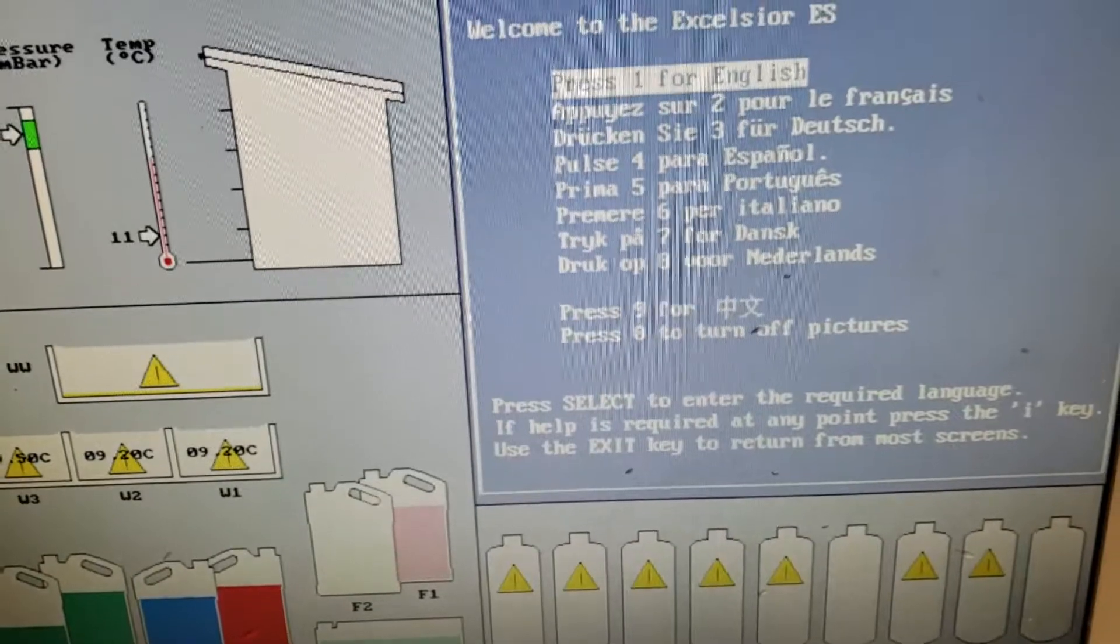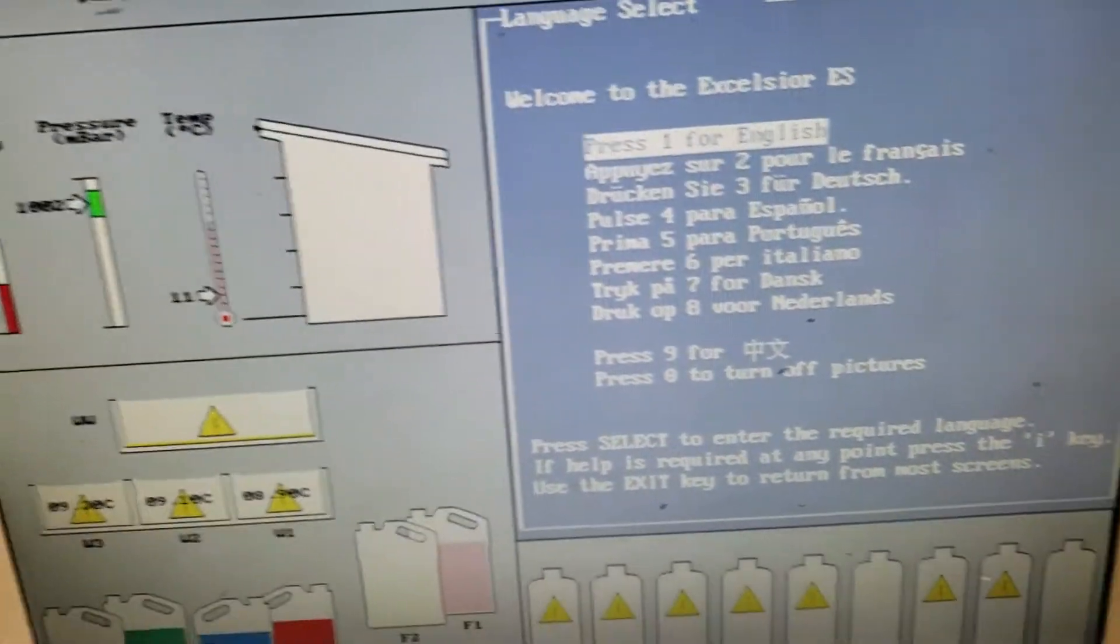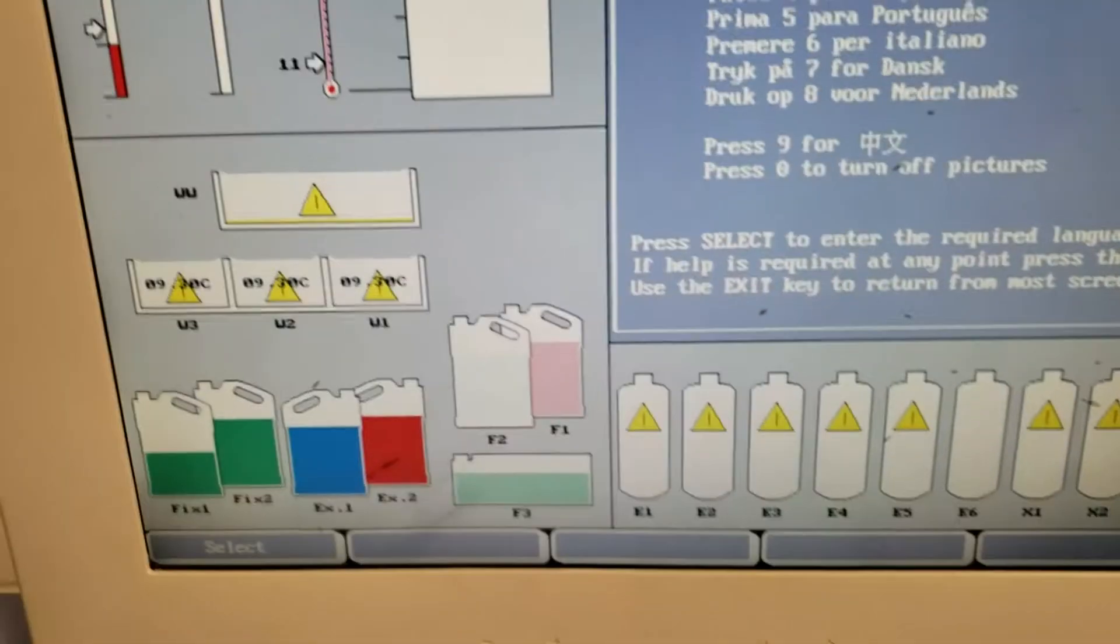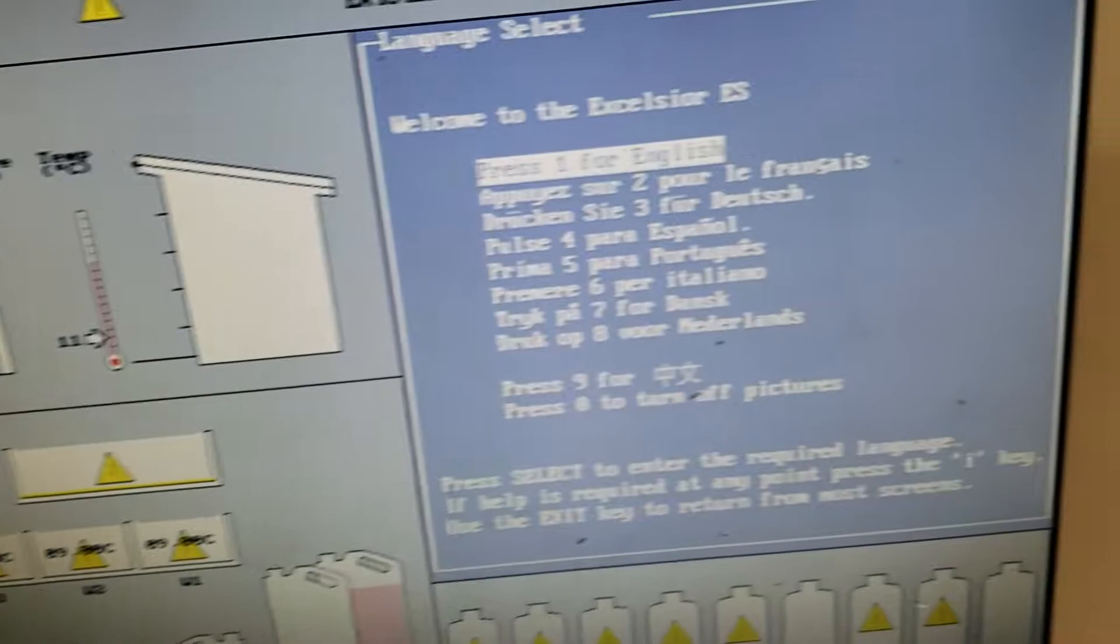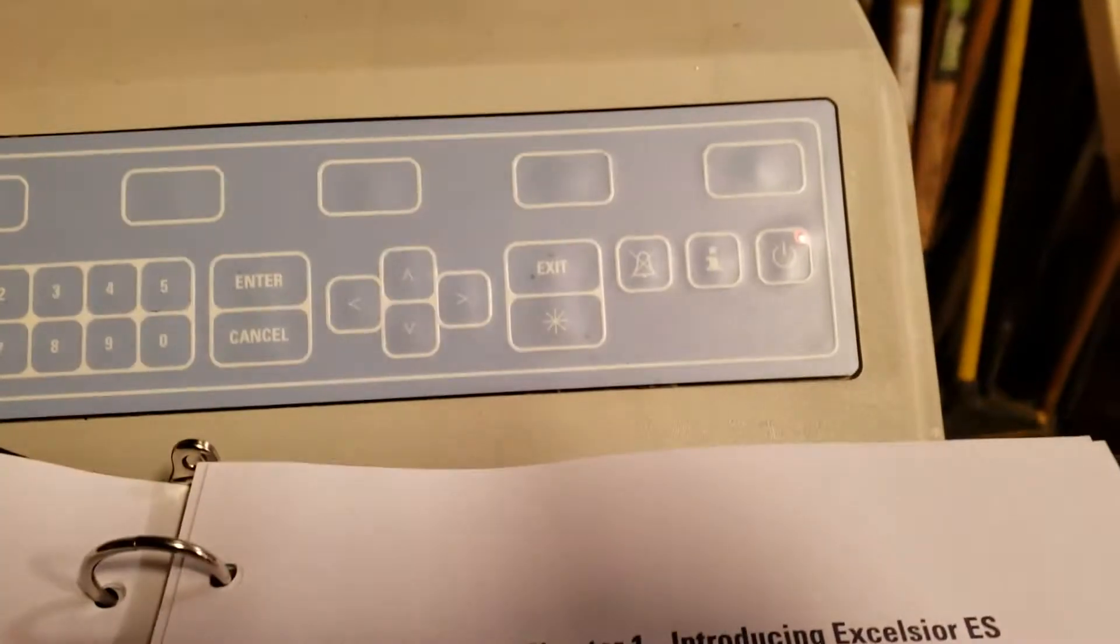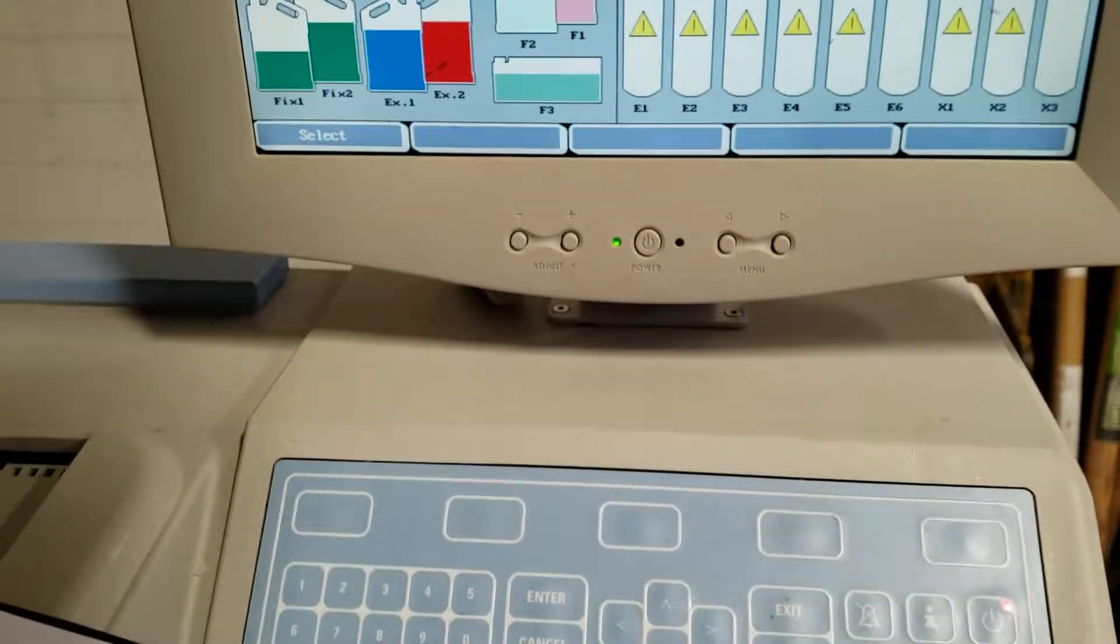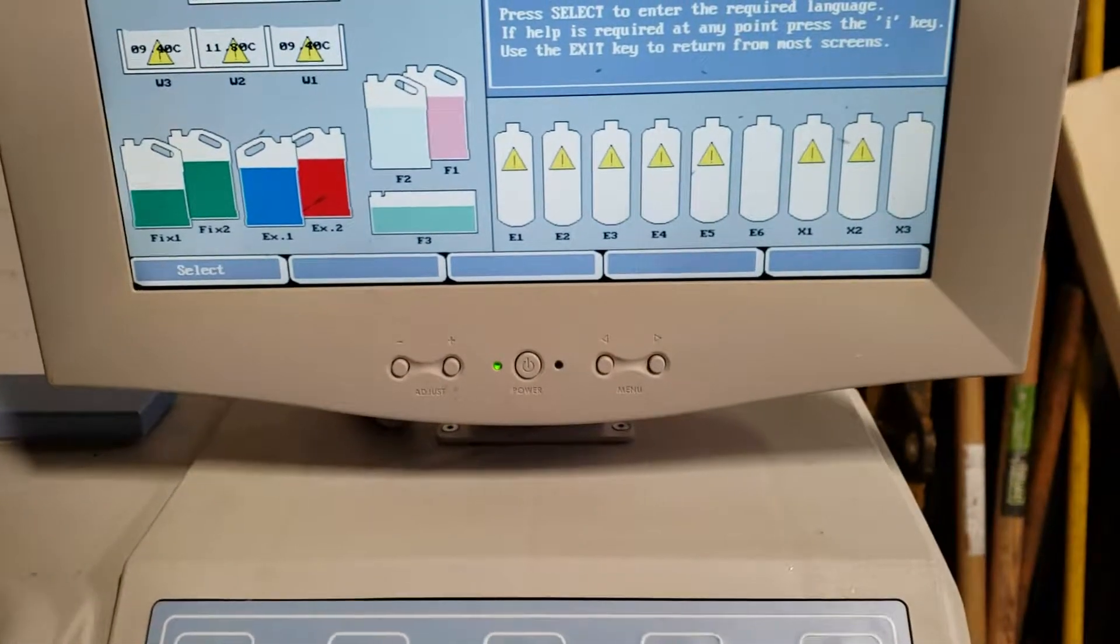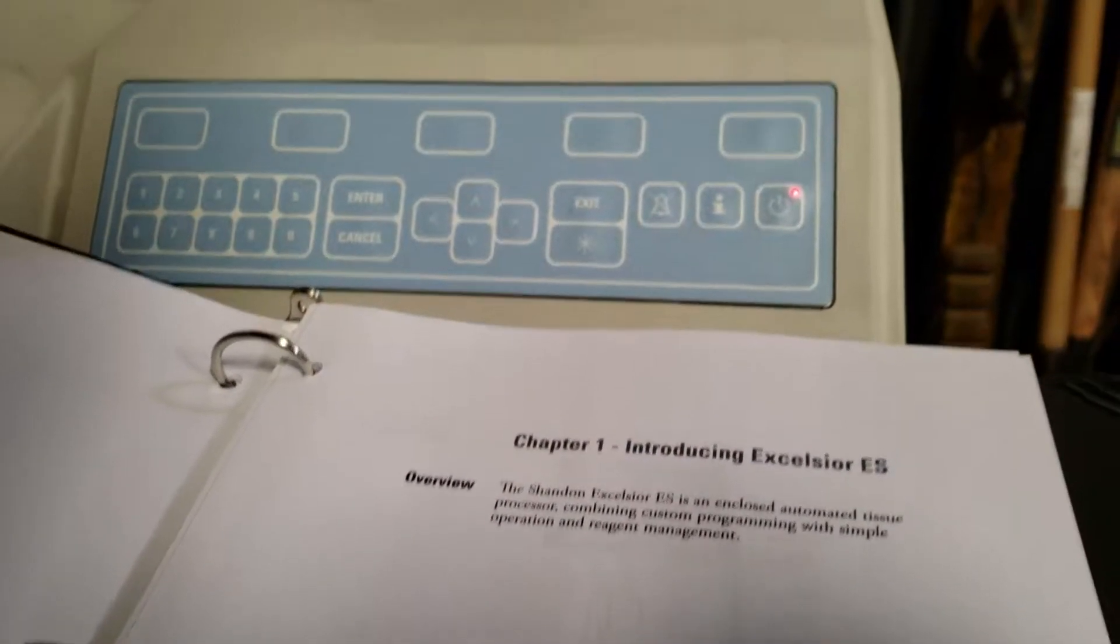The Excelsior ES is intended for use in pathology laboratories. The Excelsior ES is an enclosed automated tissue processor with customizable programs and simple operation for reagent management.